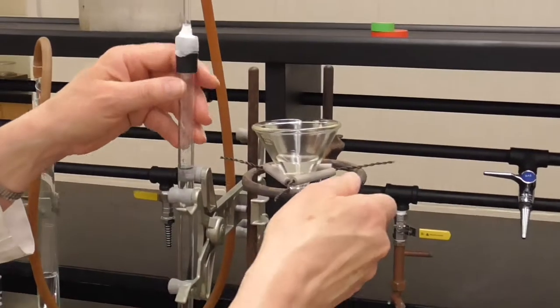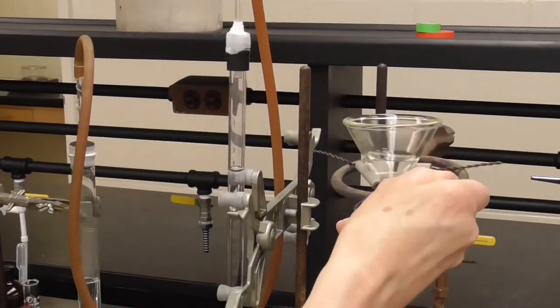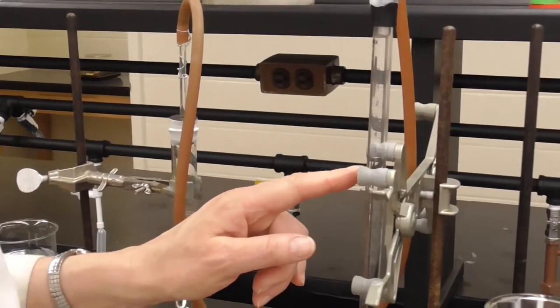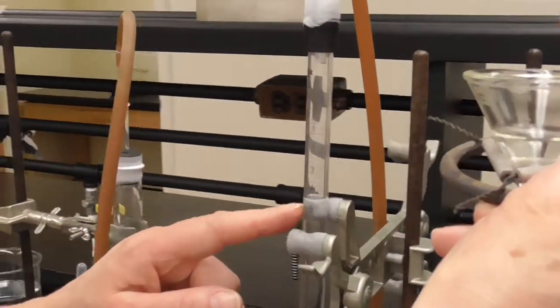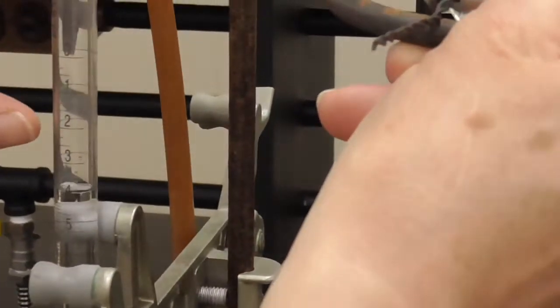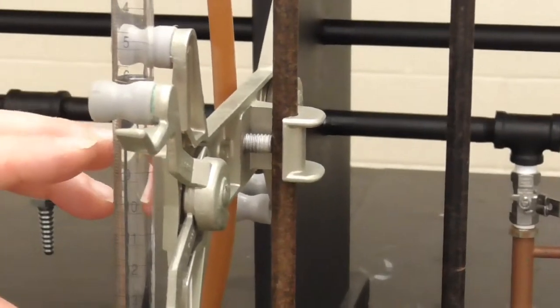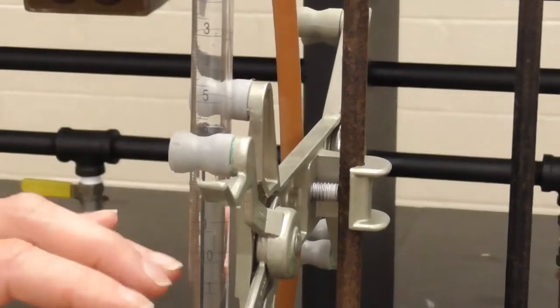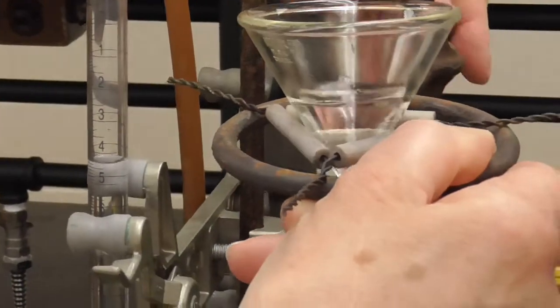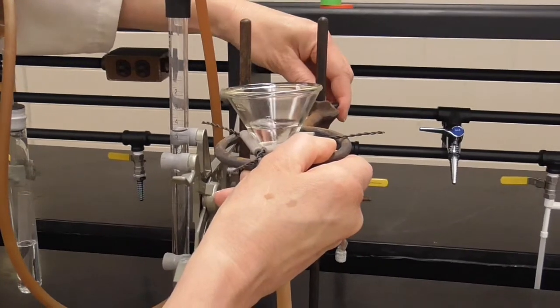Now, to test this for leaks, what I'm going to do is raise and lower the funnel and watch what happens here in the burette. There is going to be some movement of the water in the burette as I raise and lower the funnel. However, air inside of this apparatus is compressible, and that's why it is moving some. But as I drop this down, we see that the level in the burette is not moving freely as it would be if there were an air leak. And so I can be confident that we don't have an air leak in this apparatus at this point.